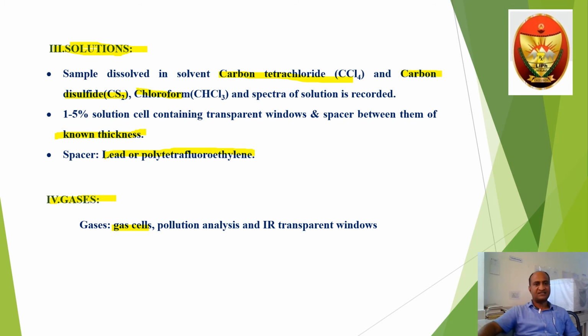And for the analysis of gas samples, gas cells are available, and they are used for the analysis of different pollutant gases.